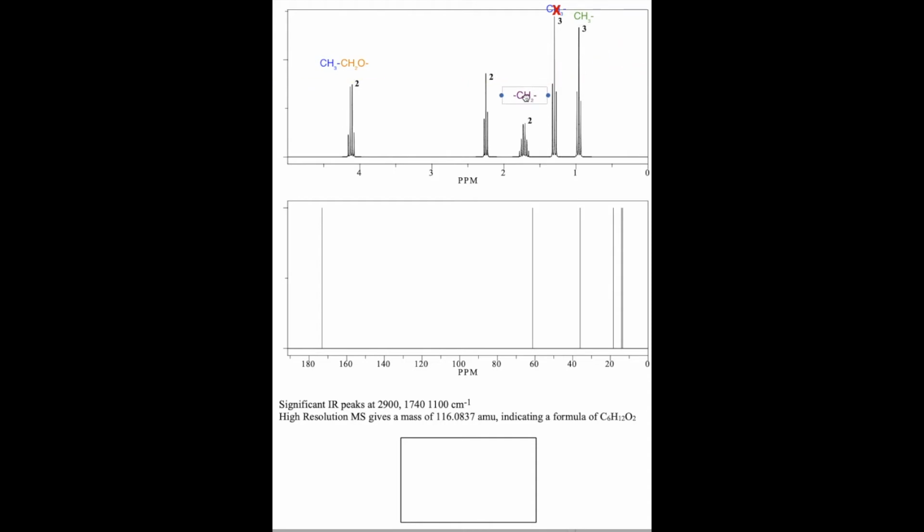And that means this CH2 in purple, right? Again, I know that's a CH2 because of the integral. That CH2 must be connected to my green CH3 methyl group. And because I've incorporated it into the pieces up here, I've attached it to this green methyl. The green methyl is the CH3, but I can imply this purple exists and then I found it here, so I don't accidentally put it into the structure twice. I'm just going to put a big red X through it down there. And that just leaves me with one last peak, this CH2 triplet. Okay, it's a CH2.